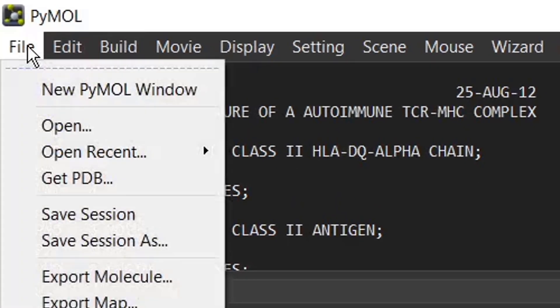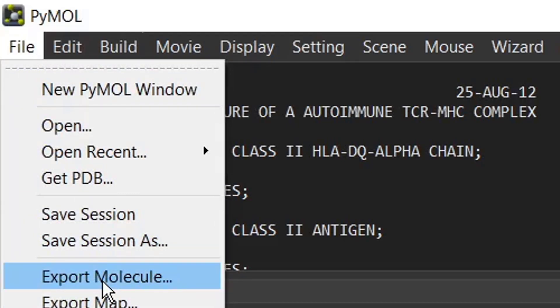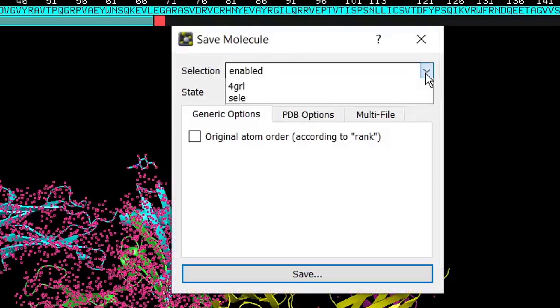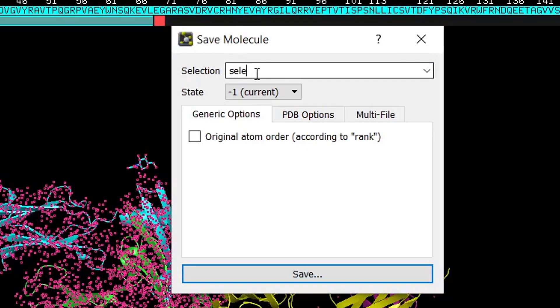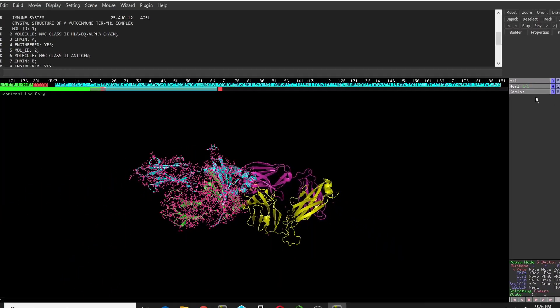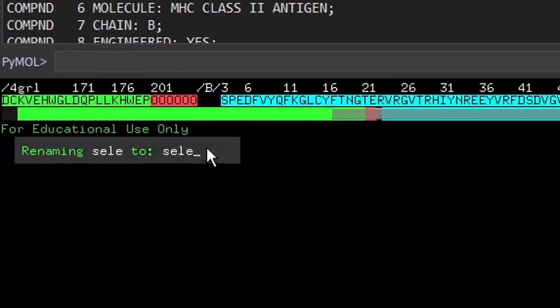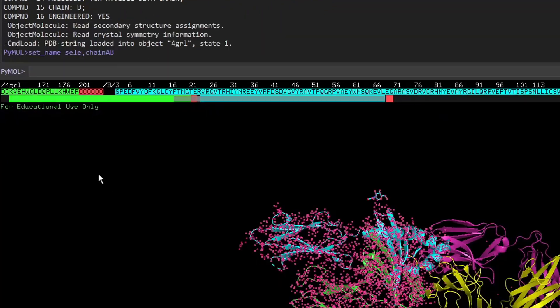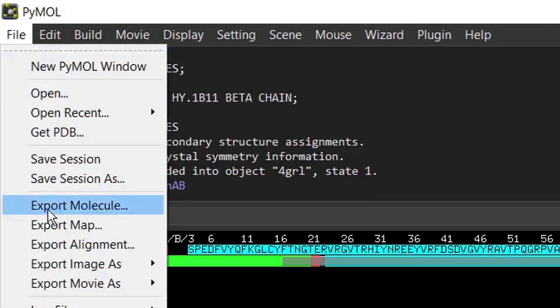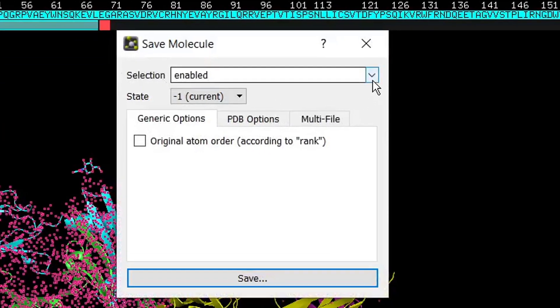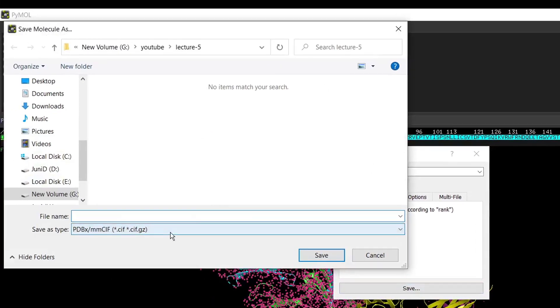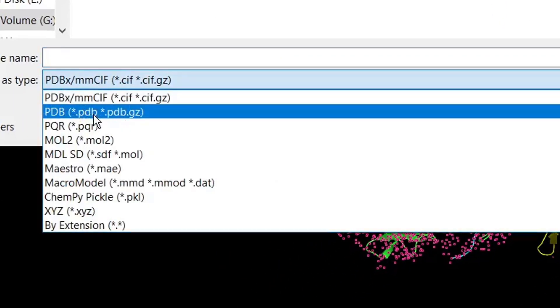Now I will save these two chains. Go to the File menu and click Export Molecule. Here, change the selection field to 'sele' (the current selection). You can also rename the selection — click Rename Selection and give it a specific name, like 'ChainAB', then press Enter. Now go to the File menu, click Export Molecule, choose the ChainAB selection, click Save, browse to where you want to save, and make sure to save in PDB format.